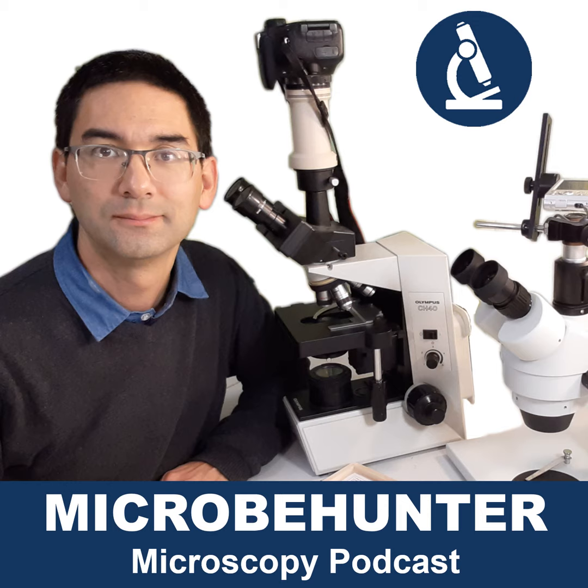So problem number 6. That's even worse than the other one. How do you like getting mounting medium on the objective? Sometimes people confuse immersion oil and mounting medium. That's a bad one if you confuse it. But it happened to me as well, and I'll tell you how this happened. It happens because of impatience, and you have to be careful here.